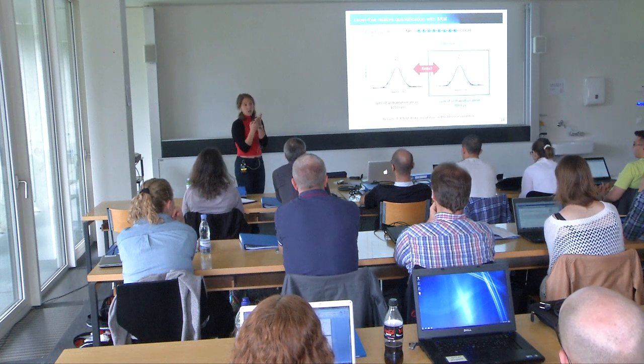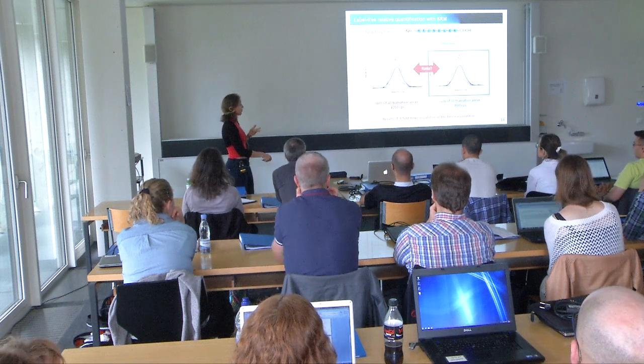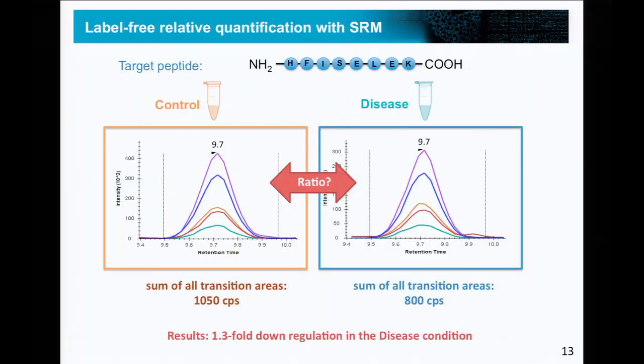Then there is the issue of statistical significance. Is this fold change that I find here significant? Is it reproducible, or is this maybe not? Is it just within my biological variability?